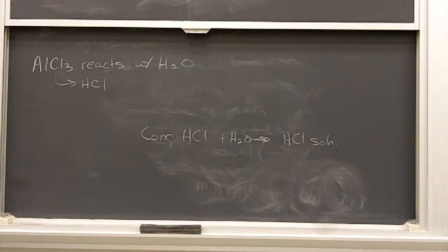And what ends up happening is you get layers that look kind of like, if you guys have seen lava lamps, where you've got a mixture of layers, and they just want to be globs of mixture together and not separate into two nice distinct layers, okay? And if you end up getting that, then we're going to use sodium chloride to help that out. But when you do the wash with water, make sure you use the sodium chloride instead of just water for that, okay?